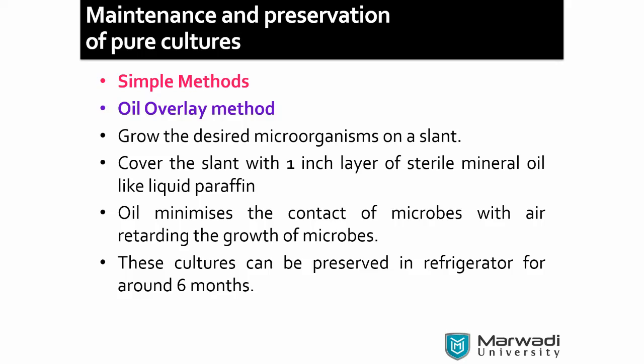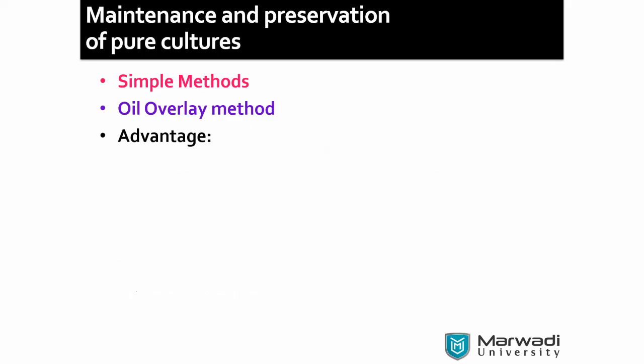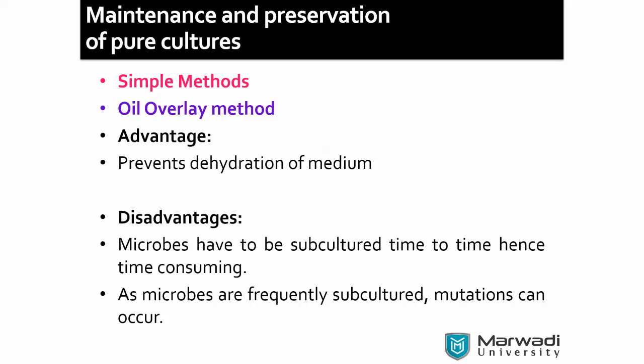It can tolerate. So bacteria cannot. Simple reason. Oil layer, yeah. Here the 1 inch layer is done. About 1 inch of mineral oil, sterile mineral oil, we may use just to overlay it, and it can be stored up to 6 months. Here it prevents dehydration of media.